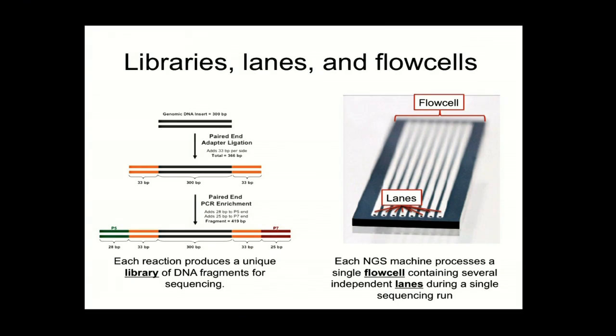So just starting to step back now that we have some idea of what the landscape looks like, I just wanted to define some terms, because you will hear people throw these around, and they're critical for understanding the next-gen analyses, the data processing tools, and really what experiments are being done. So a library is really a collection of DNA fragments that has been prepared some way.